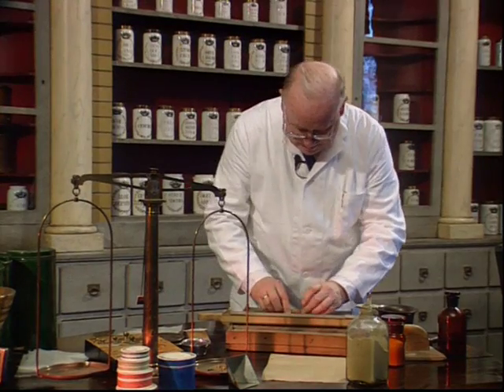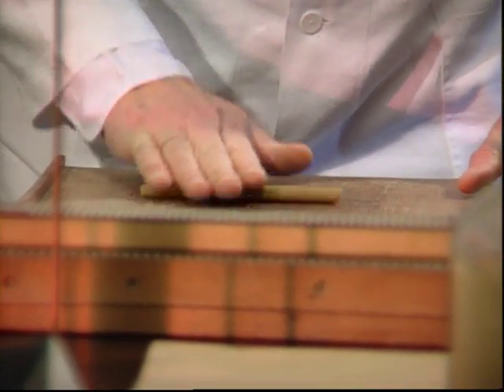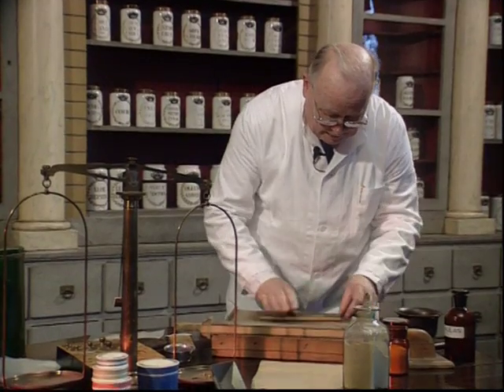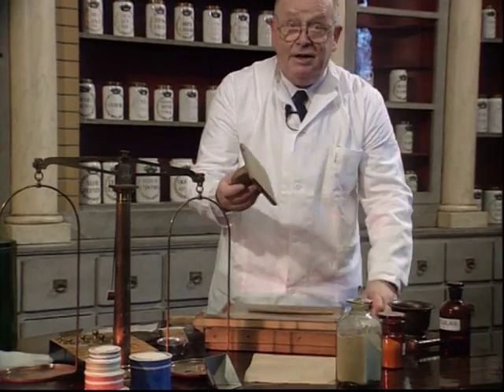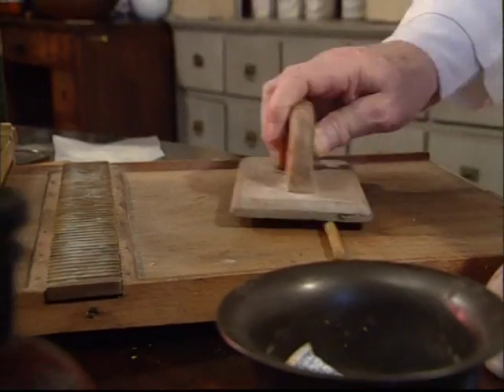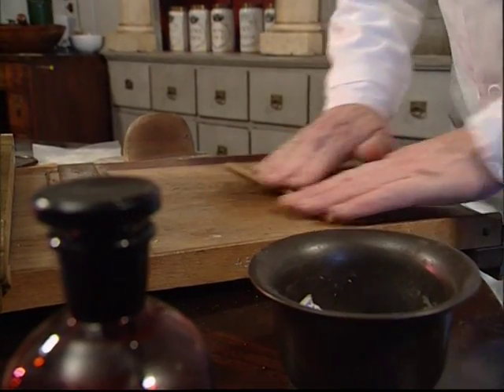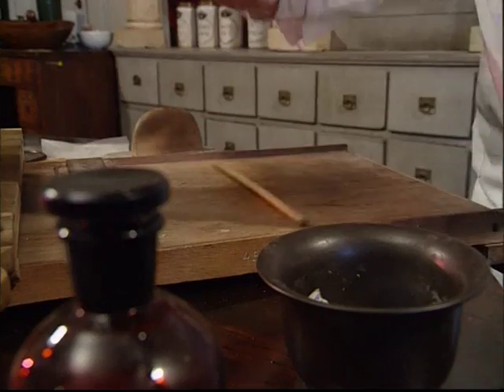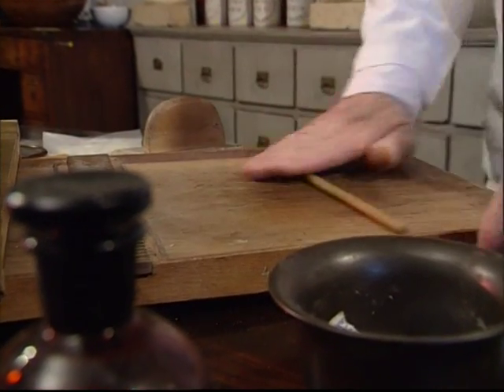And let's now see how pills are rolled. Now this has to be an even thickness, so that the finished pills are exactly the same size. So we use a pill shield. You can also try to roll it like this. Now where it's a little thicker, where it's been rolled a fraction quicker, needs a bit more in that end.